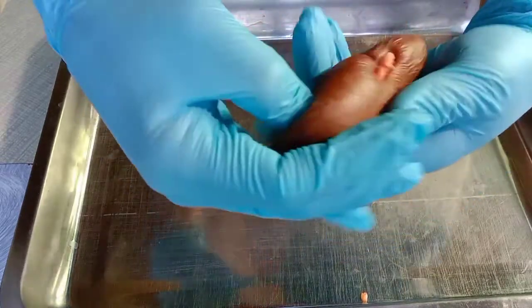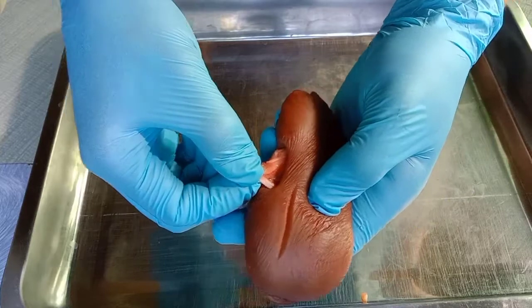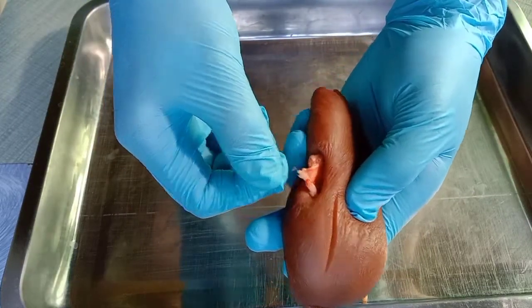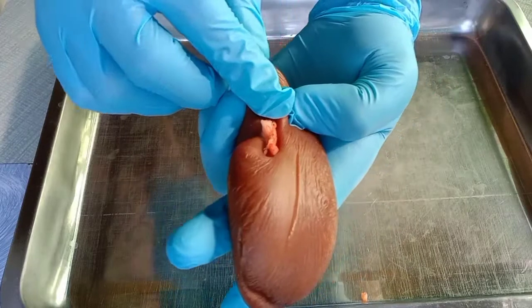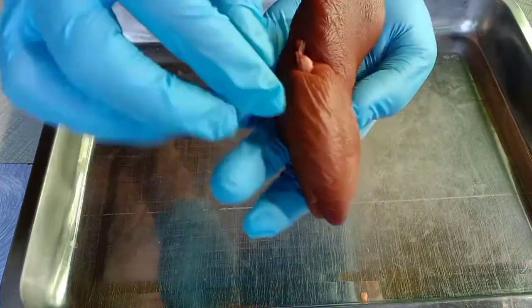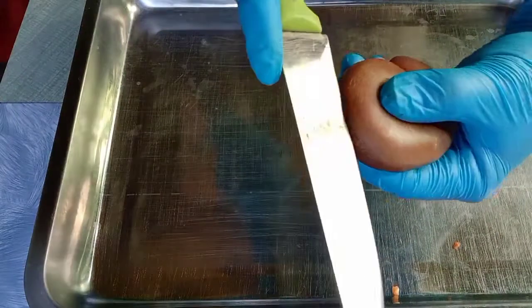Now, let us locate the renal artery that is located near the renal vein. The renal artery is where the blood enters the kidney. Now let us find the renal vein where blood exits the kidney. You can differentiate them by their wall thickness because the renal artery has a thicker wall than the renal vein. Now, let us cut the kidney in half so that we can locate the internal parts of it.